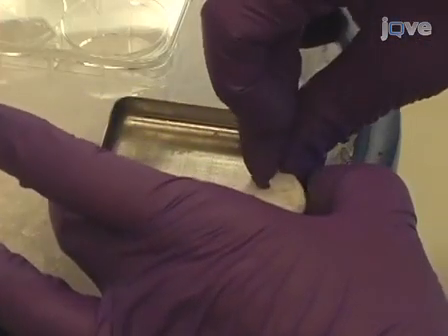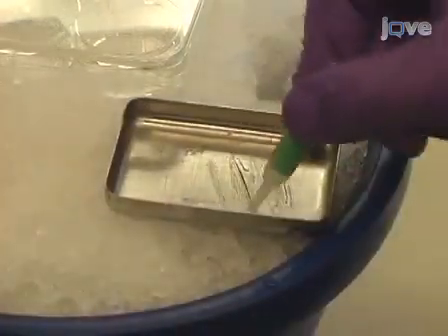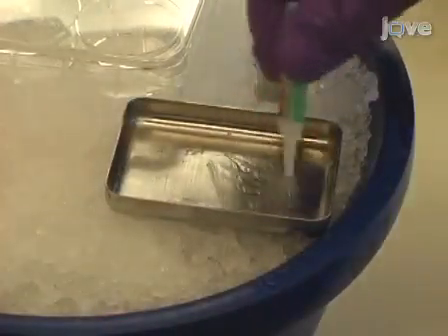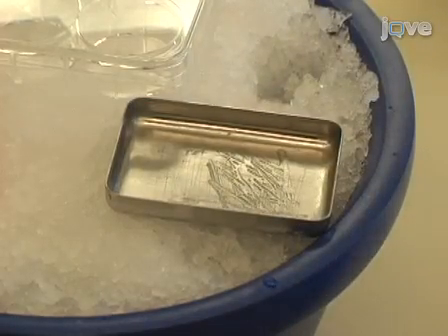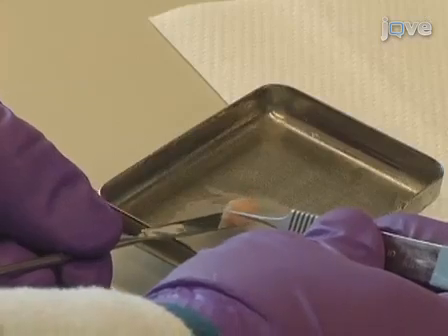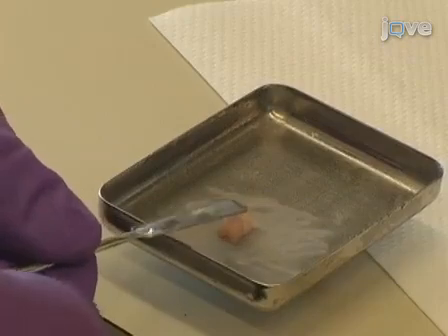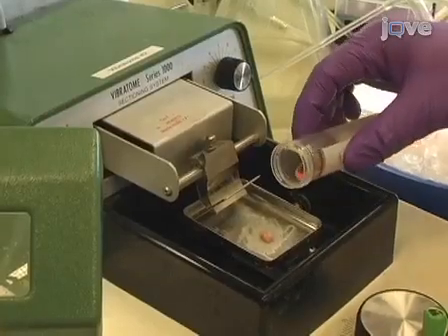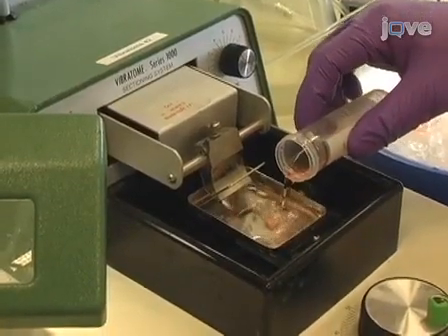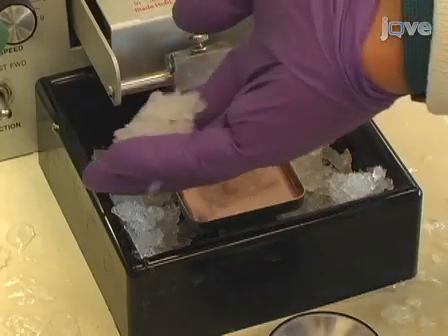Dry the chilled vibratome plate with a paper towel. Then, add a little superglue to the stage and spread it in a zigzag manner with the tip of the superglue tube to form a thin adhesive layer. Use a spatula to transfer the brain to the vibratome stage with the flattened side in contact with the superglue. Once the brain is attached to the vibratome plate, add enough ACSF media to cover the brain and add ice below the plate to keep it cold.